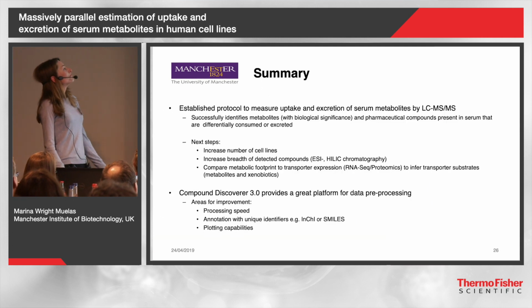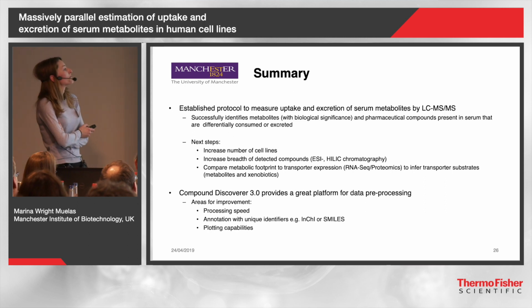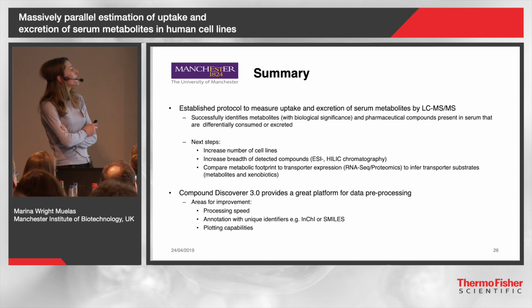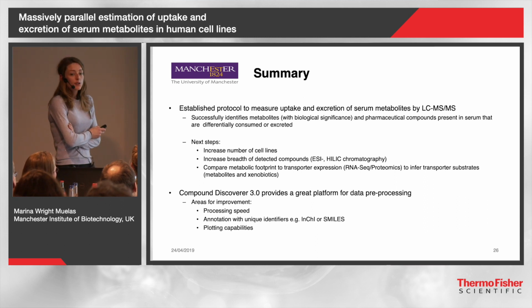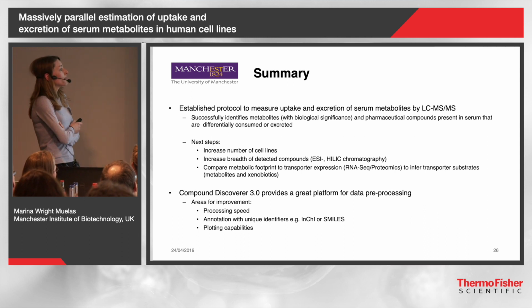So I hope I've convinced you that we've got a nice protocol here developed to measure the uptake and excretion of serum metabolites by LCMS. We're identifying metabolites both with biological significance and also pharmaceutical compounds that are present in the serum, and we're also seeing differential consumption and excretion by the cell lines.